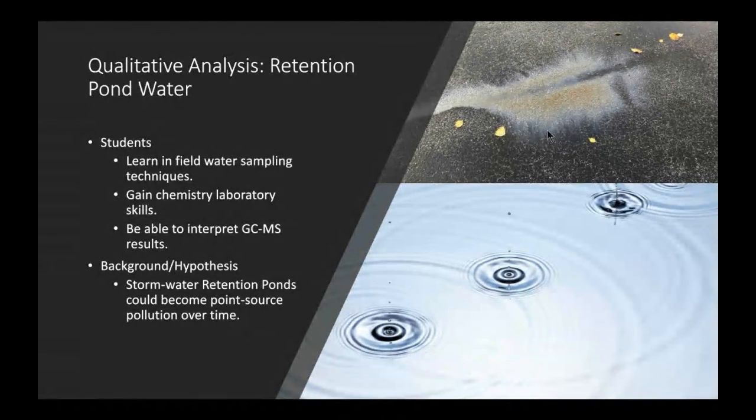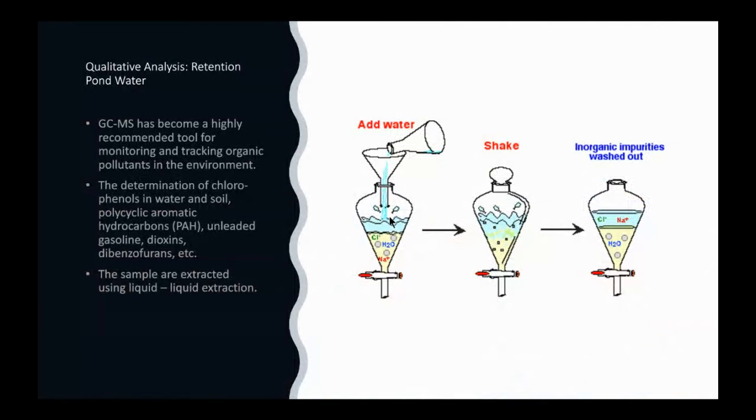All right, thank you, David. And like you said, we've got a method for this, and that method is very involved. That's kind of why we want to try and get the purge and trap. The method itself is a liquid-liquid extraction, and this is just a diagram of liquid-liquid extraction. I kind of talked about it earlier.